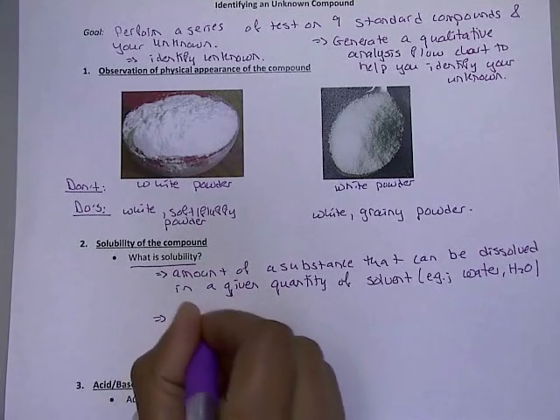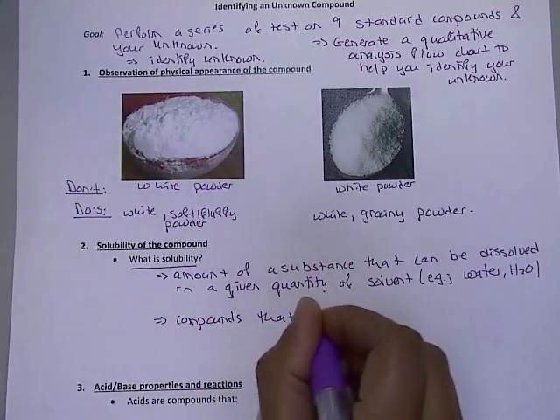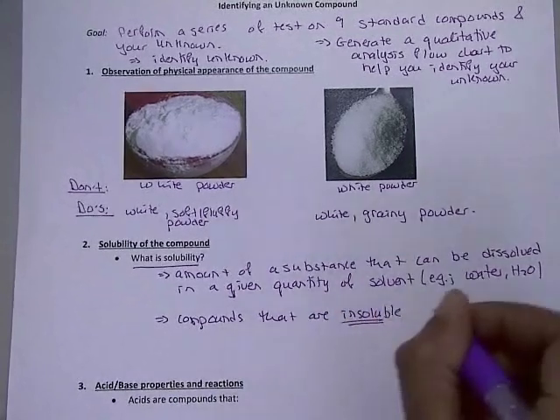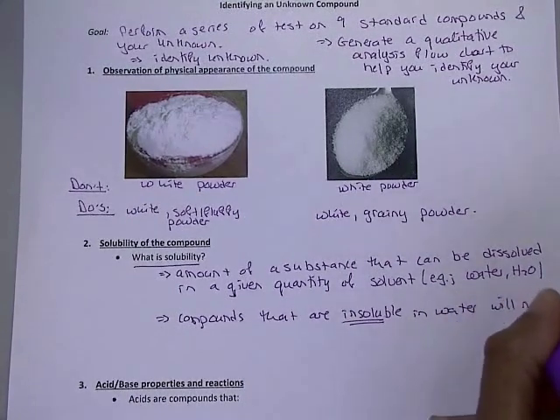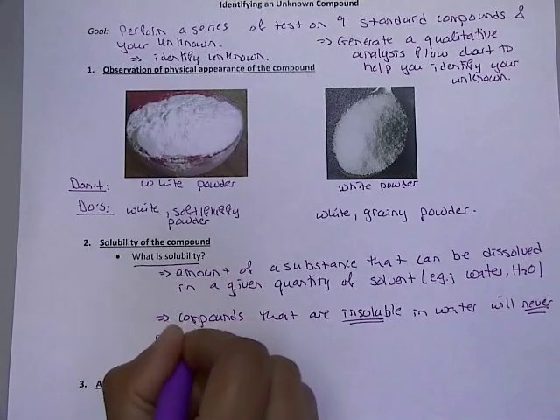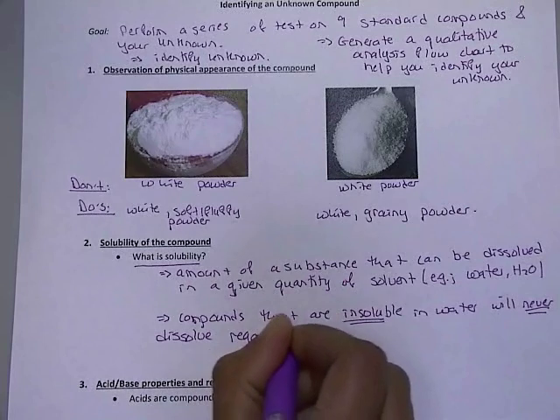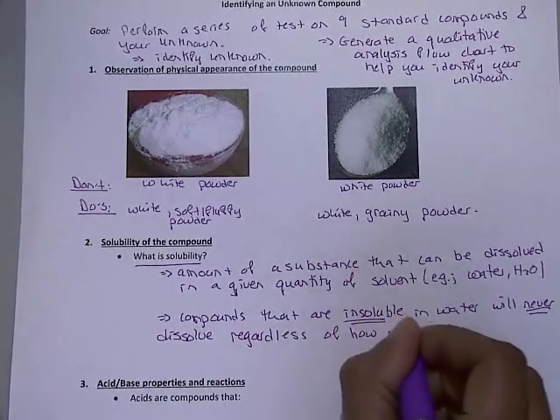So please note, compounds that are insoluble in water will never dissolve regardless of how much water we add.